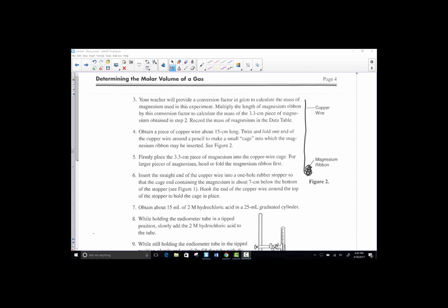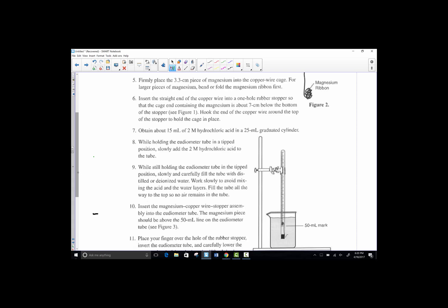We are looking at a gas collecting tube known as a eudiometer. Notice that we have a little piece of magnesium ribbon kind of coiled around in a piece of copper just to hold it in place. And we insert it into the bottom of the gas collecting tube that's been completely filled with the reactant hydrochloric acid. So we have two reactants, magnesium ribbon, Mg, which is a solid, we'll know the mass of. And we're placing that into a gas collecting tube that's containing hydrochloric acid.